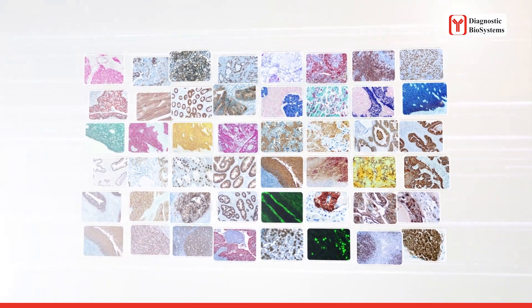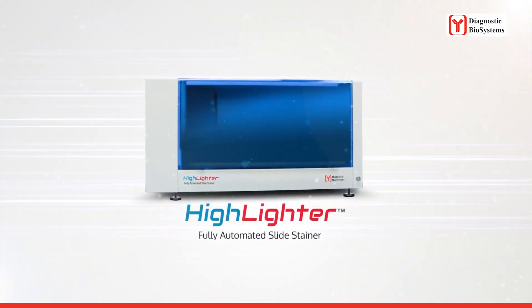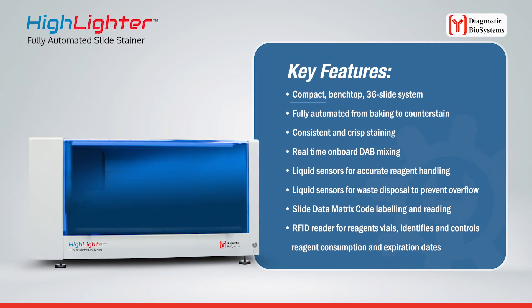Diagnostic Biosystems offers the Highlighter automated slide stainer. Key features include a compact benchtop 36-slide system, fully automated from baking to counterstain, consistent and crisp staining, real-time onboard DAB mixing, liquid sensors for accurate reagent handling and waste disposal to prevent overflow, slide data matrix code labeling and reading, and an RFID reader for reagent vials that identifies and controls reagent consumption and expiration dates.